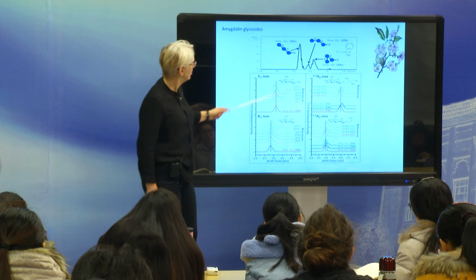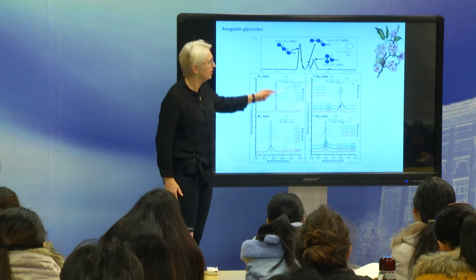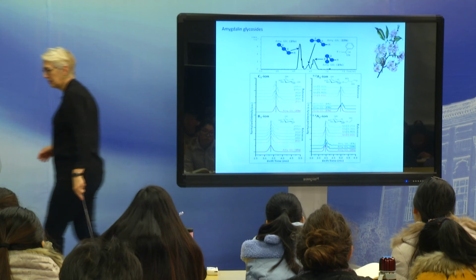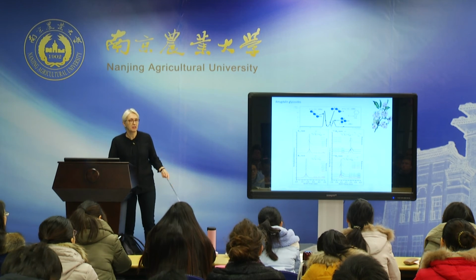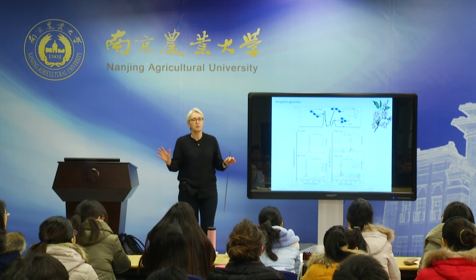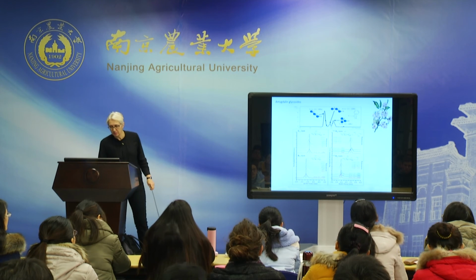And so we think for this sort of application in plant glycosides, which will always be very, very heterogeneous, this new sequencing strategy, including ion mobility, might be quite useful. And at the moment, I would say we're extending it to polysaccharides as well, because we think there are a lot of areas where carbohydrates are very important, but you don't really have the biosynthetic knowledge, you don't have the standards you have for the N and O glycans, and then this sequencing might be quite useful.